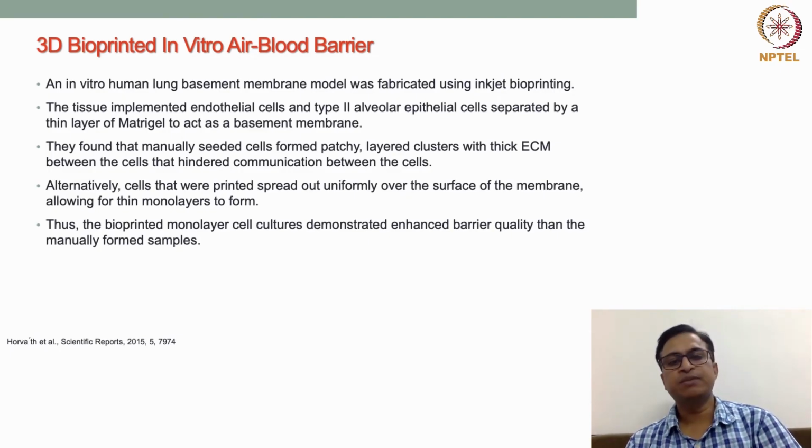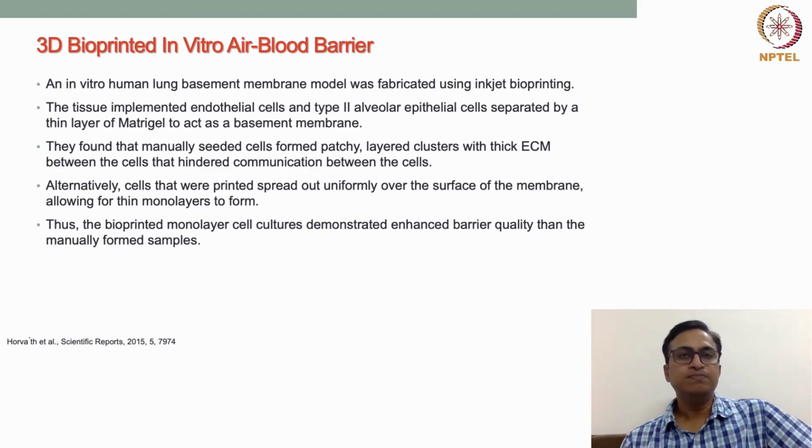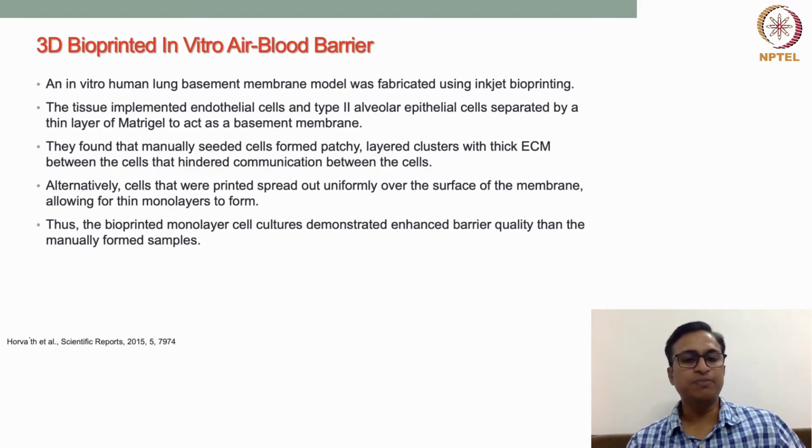So they found that the manually seeded cells... they have also done another thing: they have compared both bioprinted and manually seeded cells for fabricating this kind of structure. We'll discuss the fabrication, how they used inkjet printing for fabricating the structure. But they have also compared them, manually seeding both.